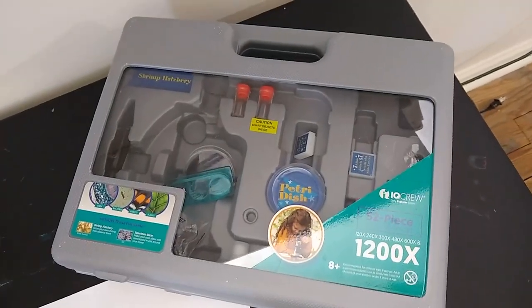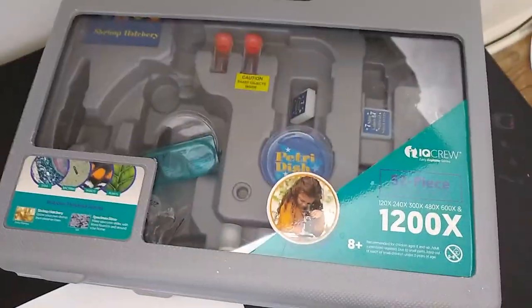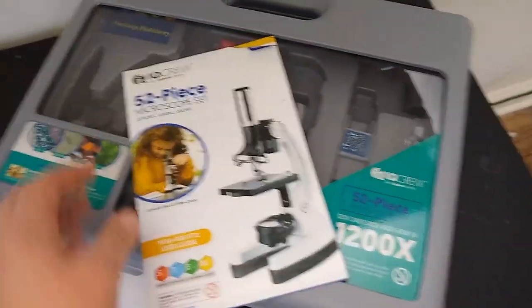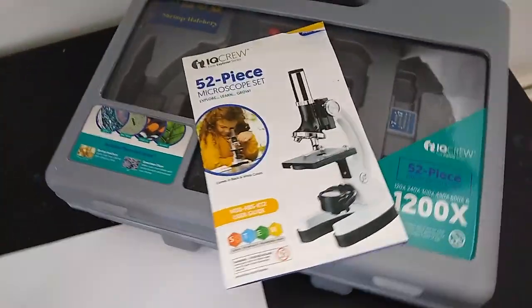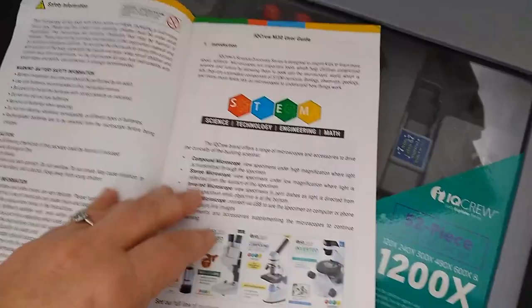This is the IQ Crew Early Explorer series microscope. It's a 52-piece microscope and it goes to 1200 times X. I think this is just a really great starter kit for kids to get acquainted with microscopes and get to see some things under the microscope.